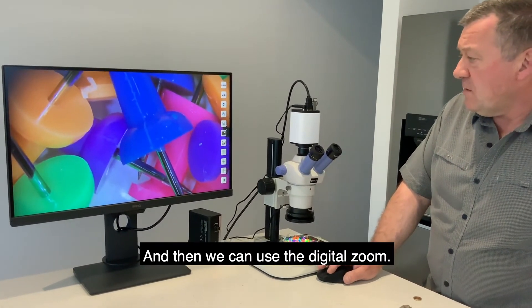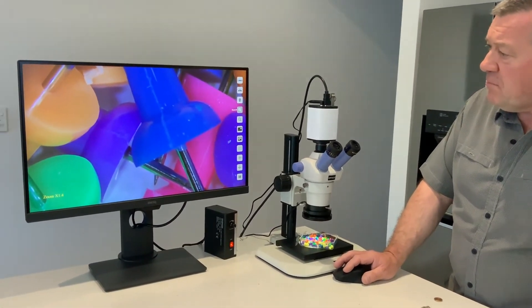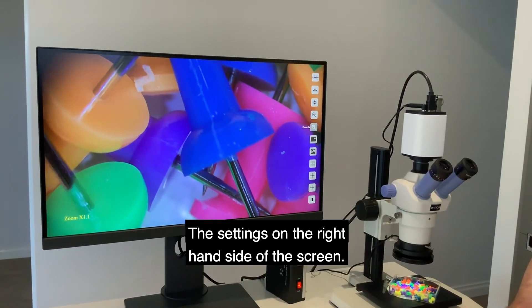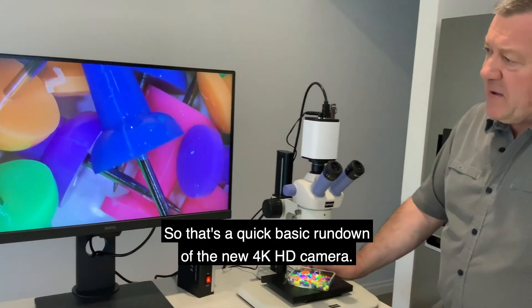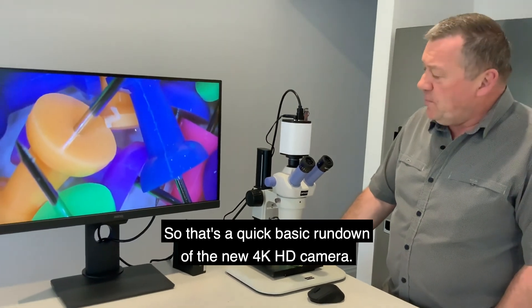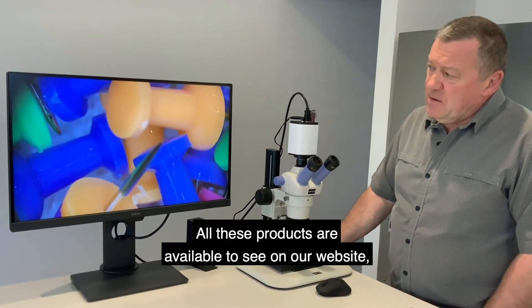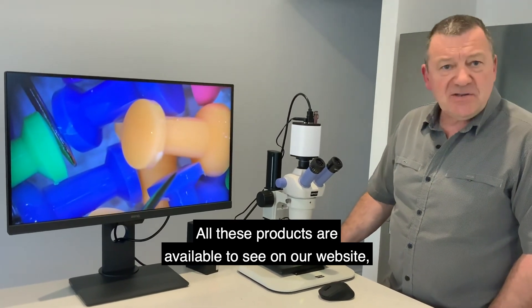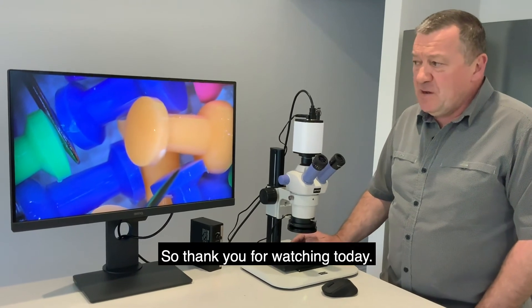And then we can use the digital zoom, with settings on the right-hand side of the screen. So that's a quick basic rundown of the new 4K HD camera. All these products are available to see on our website at microscopes.com.au.